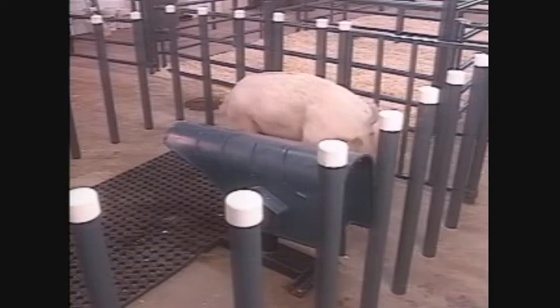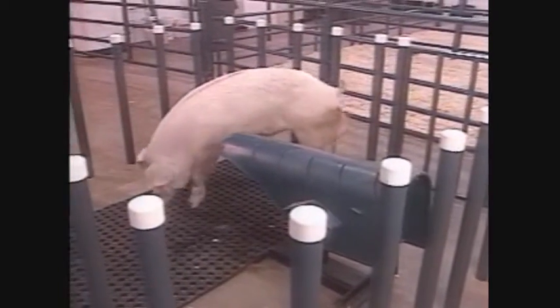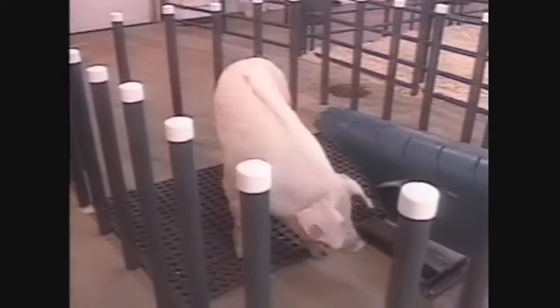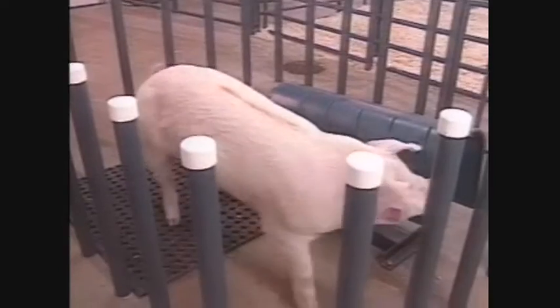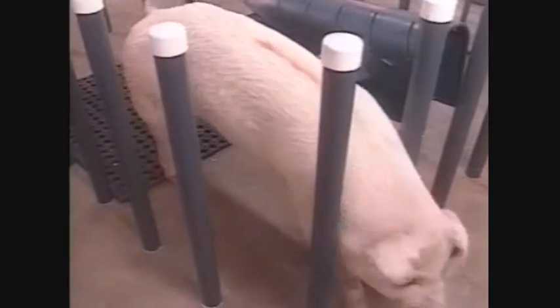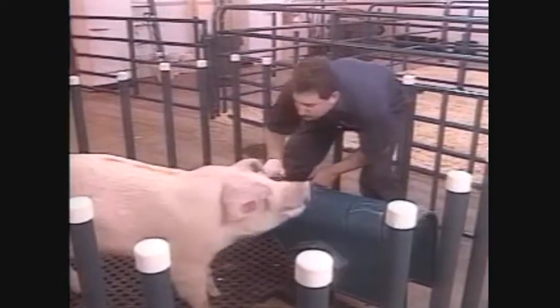A typical training session will begin with a period of up to 5 minutes during which the boar is allowed to investigate alone the new surroundings of the collection pen. The boar may show immediate interest in the dummy sow. If this is sustained, immediately enter the pen and start working with the boar. If after 5 minutes or so the boar has shown no interest in the dummy sow, enter the pen and begin working with him. Always conduct yourself in a calm, steady, and determined way during training sessions.